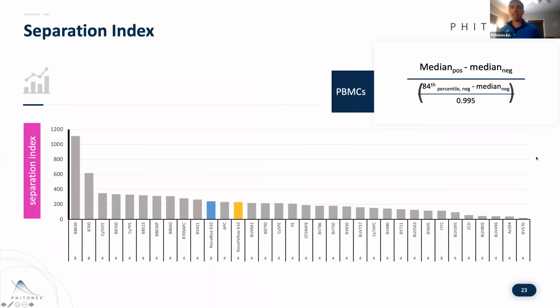But the other result that I think is equally as important when we think around the notion of brightness, right? Because we've never categorically defined brightness in our field. What is brightness equals what, right? It's hard to really know, because you can tune laser power, you can change your gain, right? When we're thinking about it, brightness really means the ability to separate populations, right?